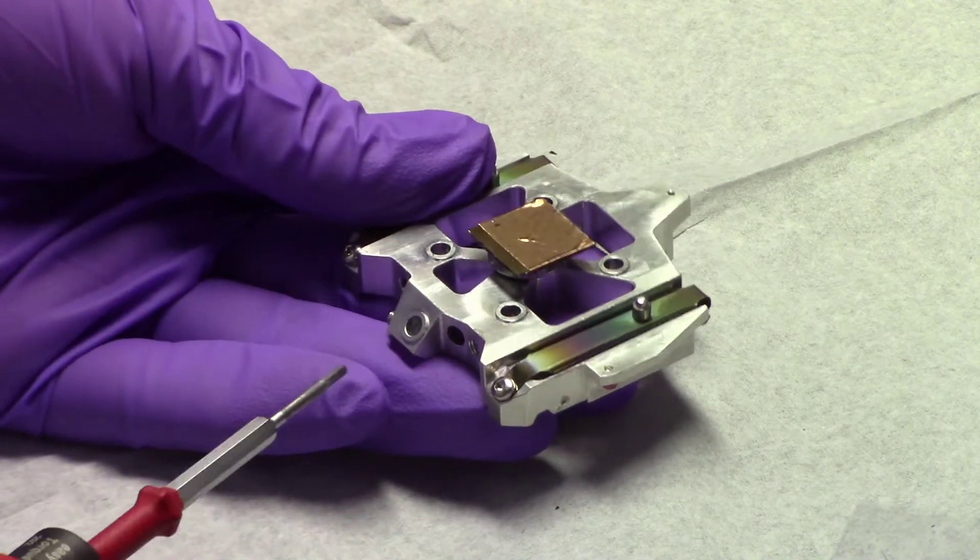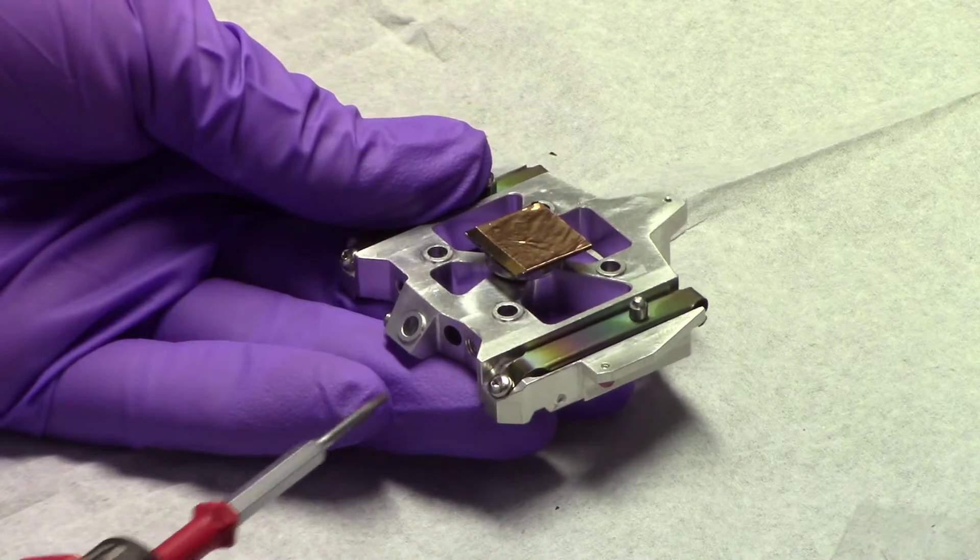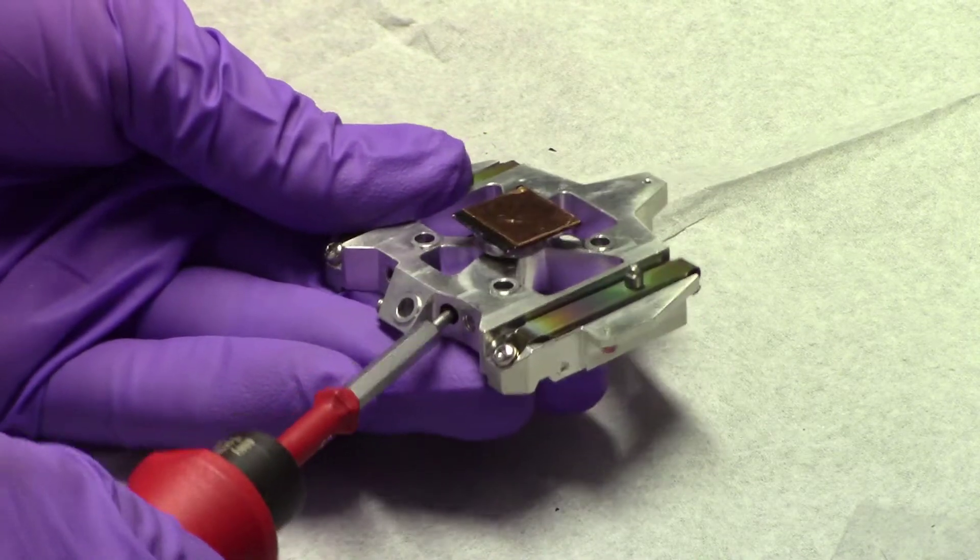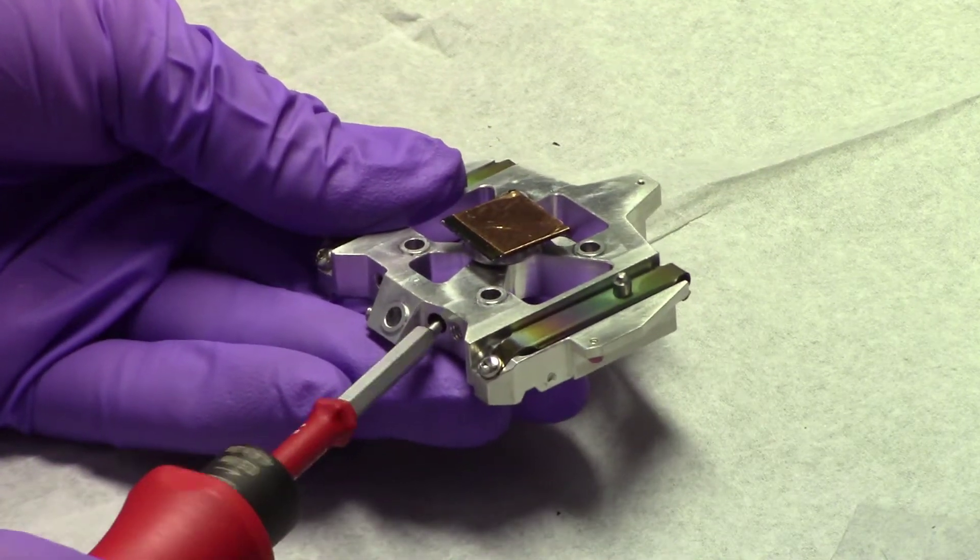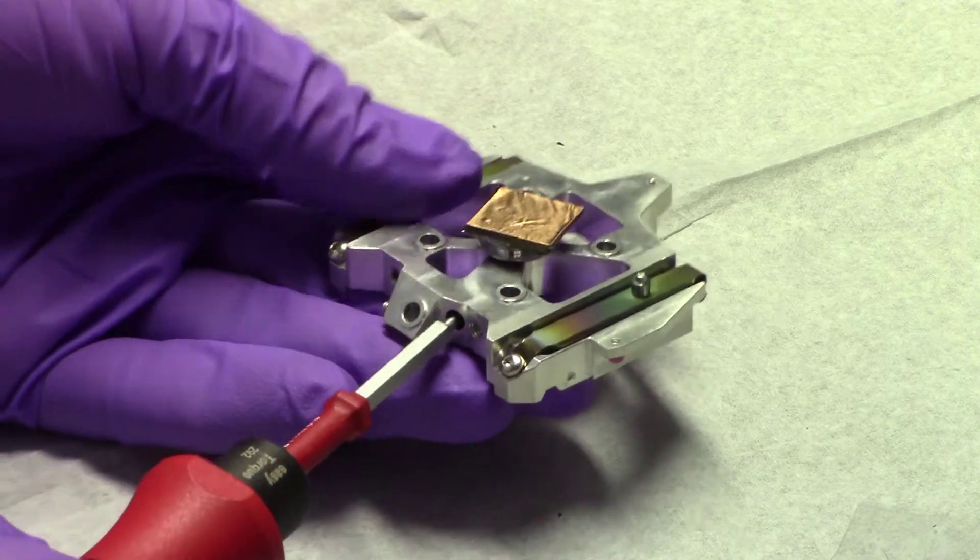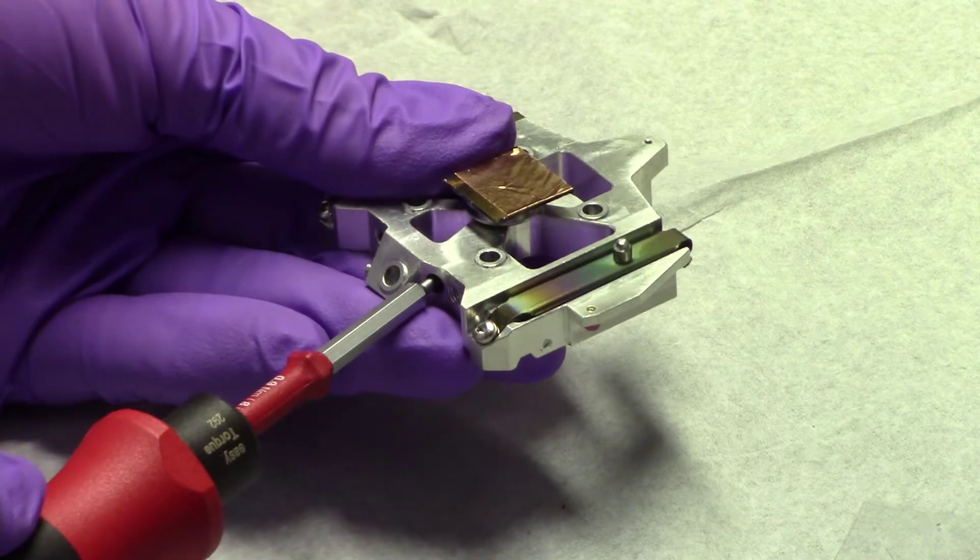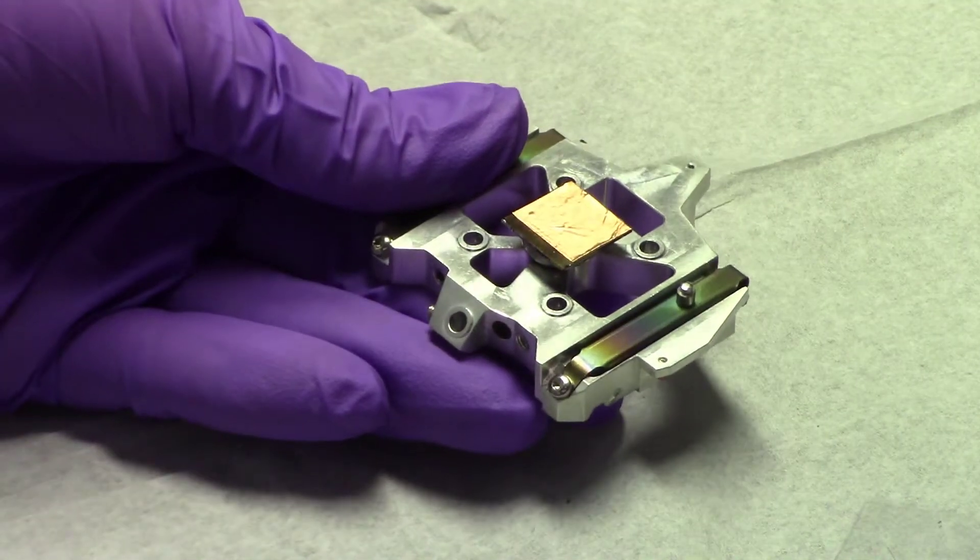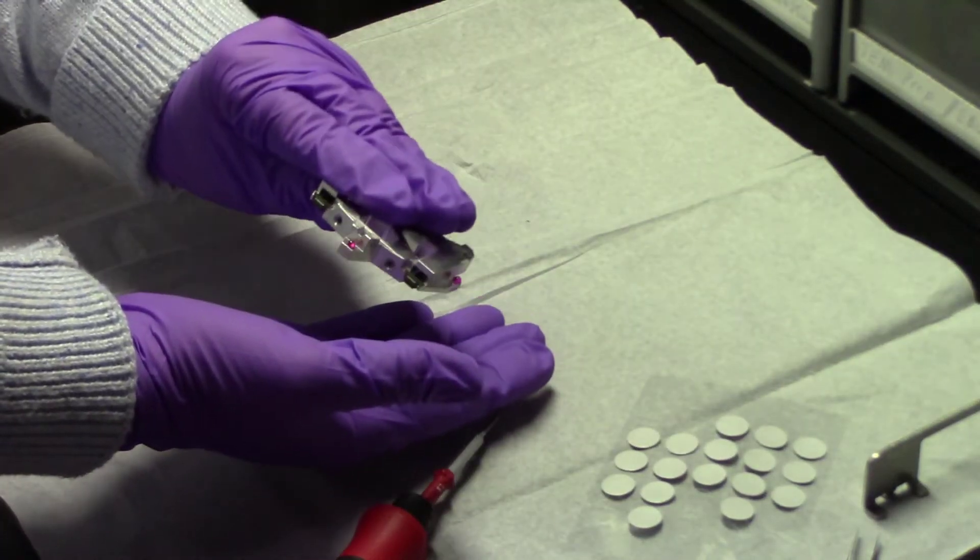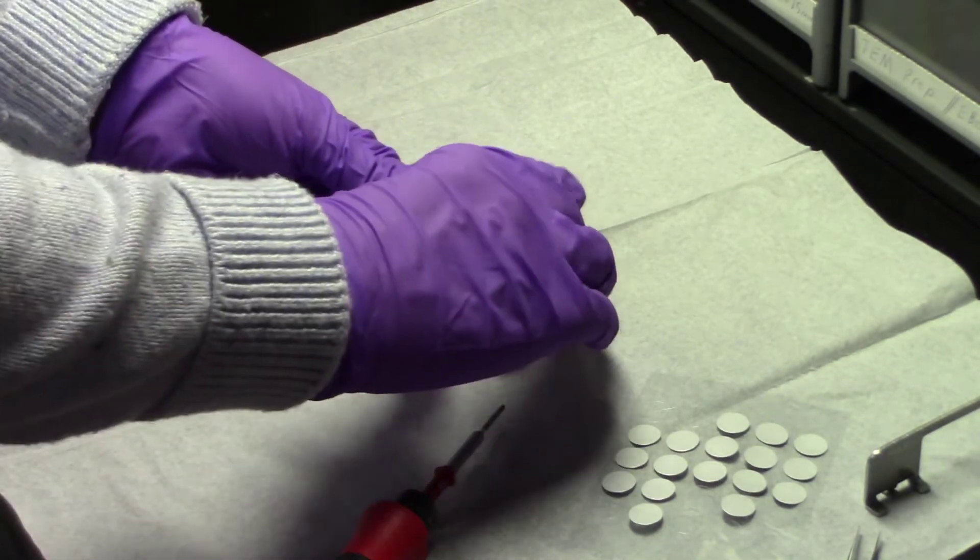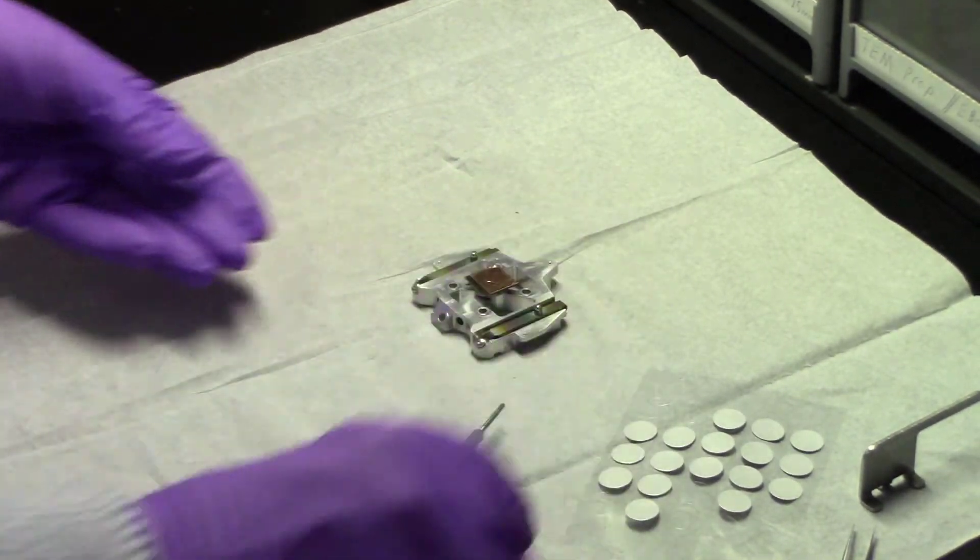Once you've determined the size and number of samples you'd like to load, use the screwdriver to gently tighten each set screw. You may want to tip the shuttle upside down to ensure that your samples do not fall out.